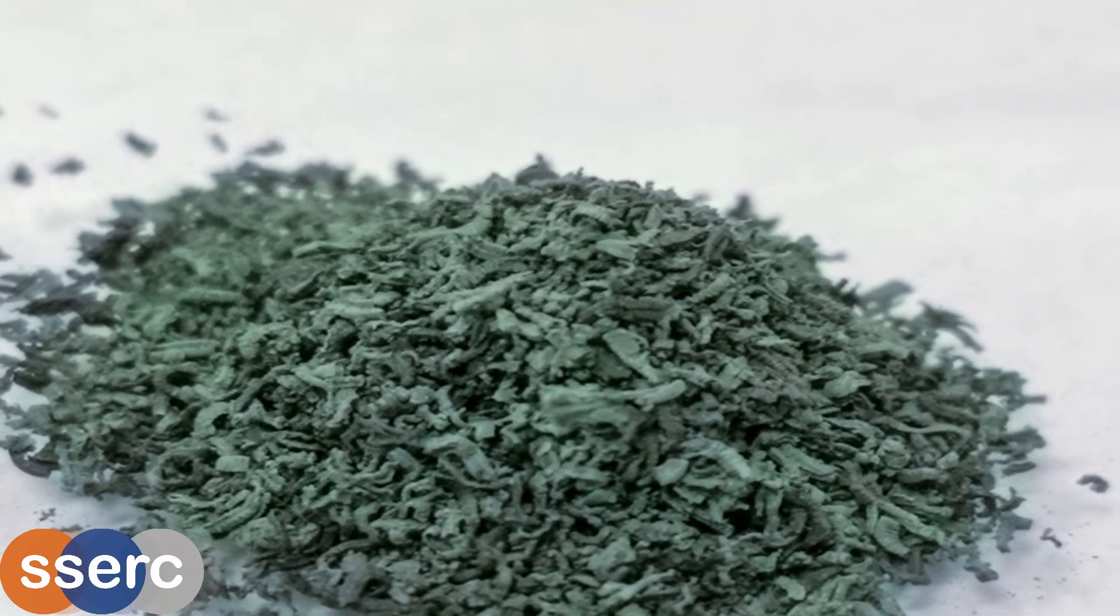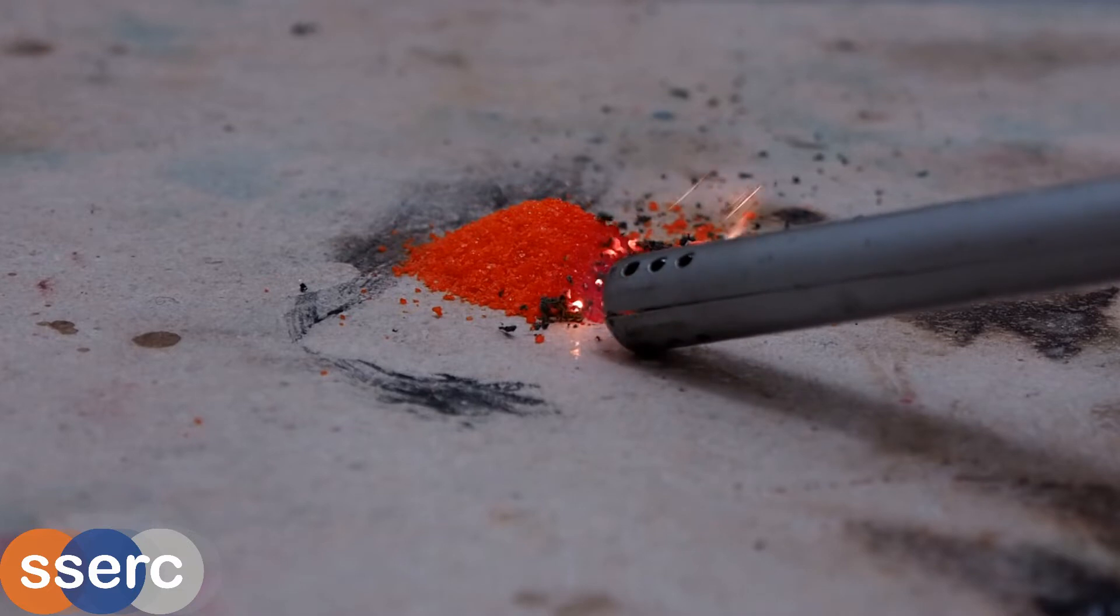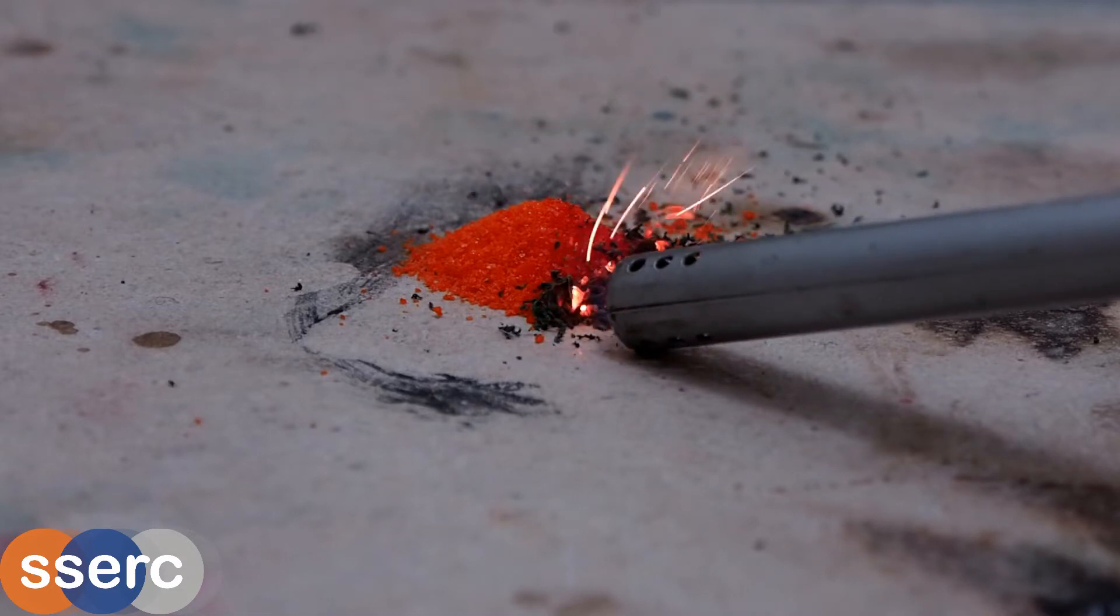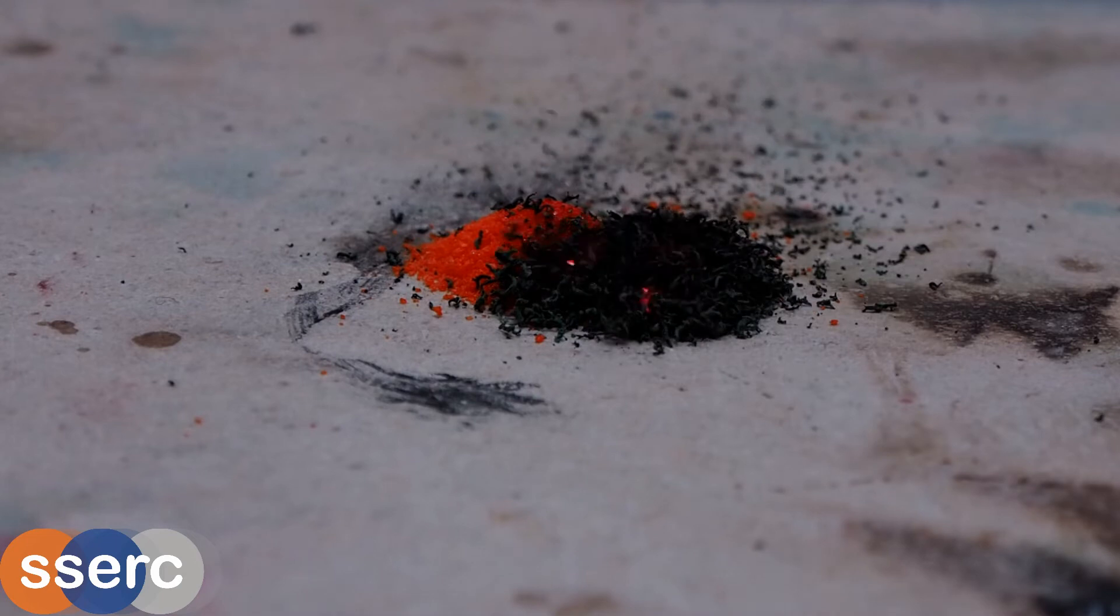The chromium oxide you buy won't work for this. Instead it needs to be generated by the thermal decomposition of ammonium dichromate. In itself a great demonstration.